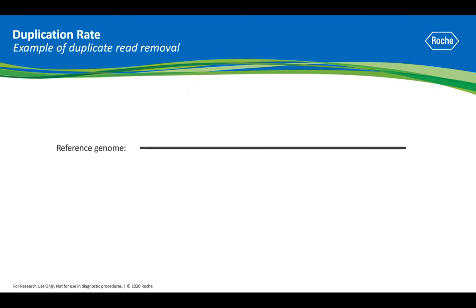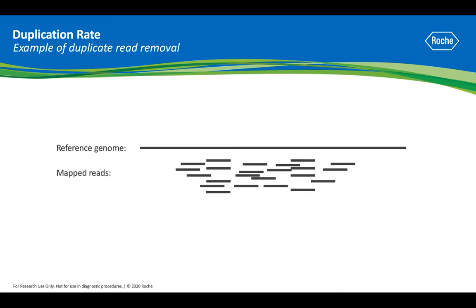When assessing sequencing coverage, we start with the reference genome that the sequencing reads will be mapped to. To get the most out of your sequencing resources, you want the majority of sequencing reads to map to unique locations on the reference genome. Duplicate reads, shown here in blue and green, map to precisely the same location as other reads, and thus they provide no new sequencing information.